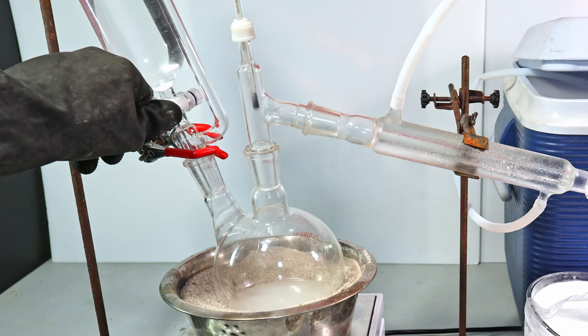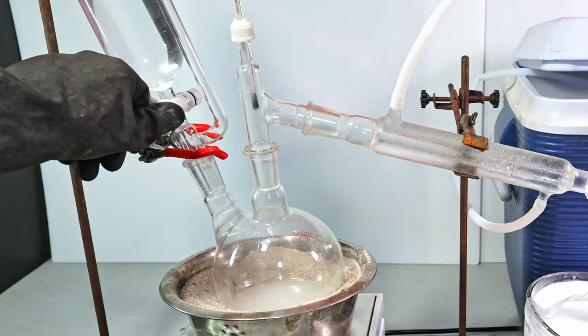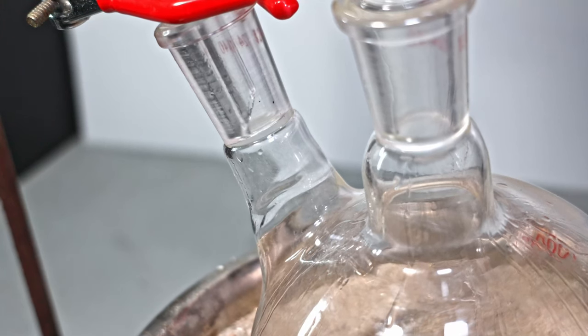It is important to drip the tert-butanol in slowly so dehydration can proceed quite rapidly without the interference of alcohol.